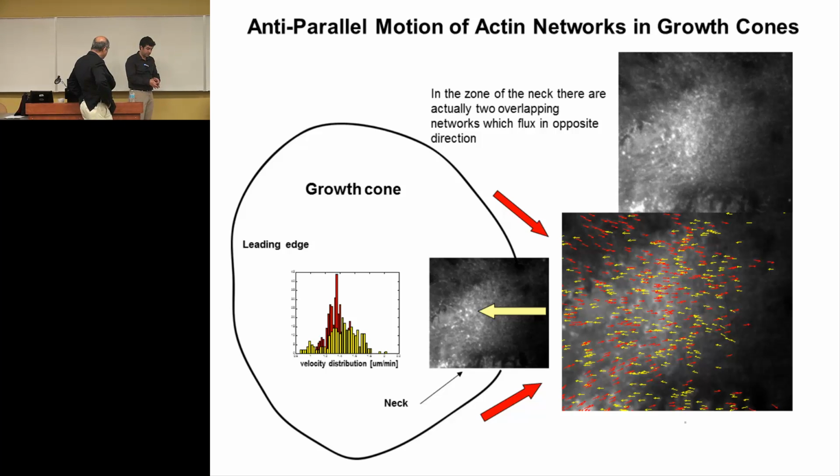No. You have a dish, and you put it under the microscope, and it stays there, and inside the cell is just. Right, but say you're studying cell division. You're looking at this entire flow and everything. Yeah. And that's within the cell. Is the cell itself moving or not? They are moving, yes.